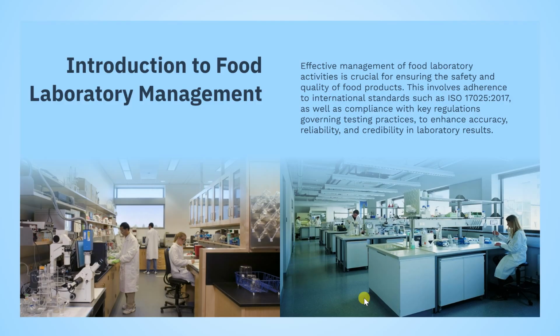You see the neatness, the cleanliness, and even the ventilation, the lights, the boards, the working benches or working tables, and the sink that is available at each and every station where they are conducting the tests. Everything is well organized, and if someone wants a stool to sit on, the lab provides everything. So when they come to audit and certify you for the standard, they make sure that each and everything is in the right place. Please watch and learn. A picture says a thousand words. Much will be said later.